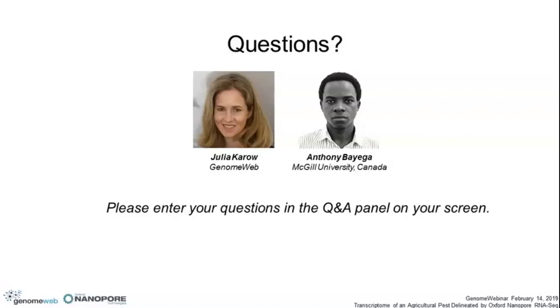What other QC did we do? Again, we use things like cutadapt to trim adapters, but also to identify reads that have adapters in the middle, so that we either take them out of our dataset or split them where they find adapters, so they don't have chimeras. And what else? That's what I can think of right now.